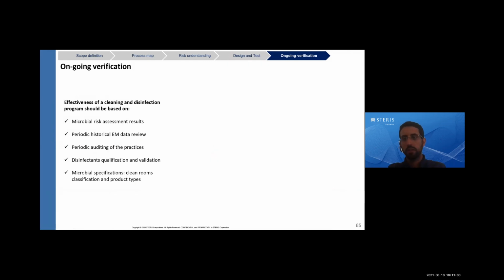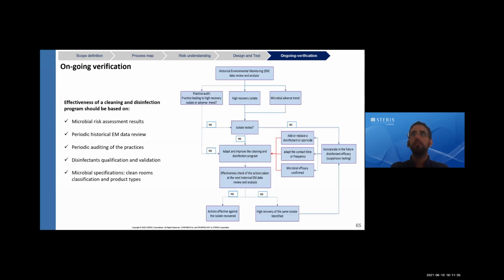So now that we close the parenthesis for isolator and for ISO 5, we have how to clean our clean rooms and how to clean our critical area like the RABS, isolator, hoods, or LAF, or unidirectional flow. Now the goal is to go through the evaluation and assess what we have designed as procedure and what we have defined as type of disinfecting agent, type of technology to use, type of procedure that is put in place. Is it working? And the way to perform that, again, is to look at your historical EM data.